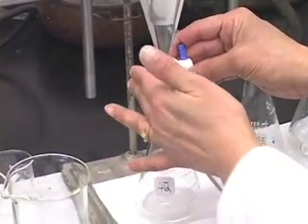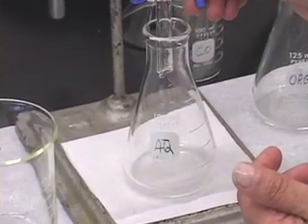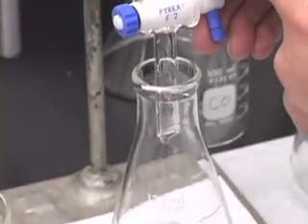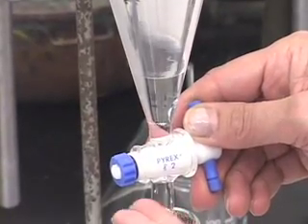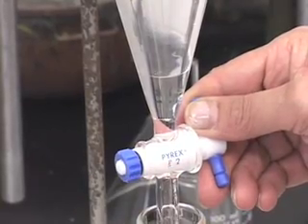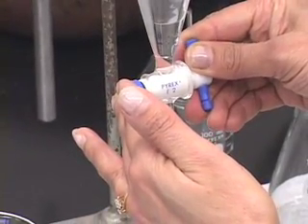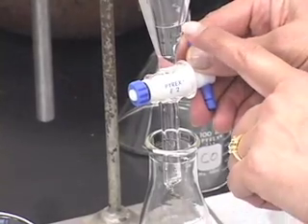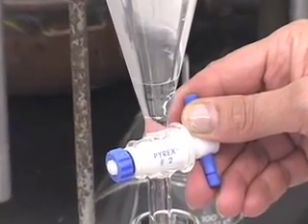The aqueous layer is draining. The boundary between the two layers is getting closer to the stopcock. If you are not very sure of controlling the stopcock, reduce the rate of flow so it goes a little more slowly. When the layer demarcation reaches the Teflon plug, you can close the stopcock.